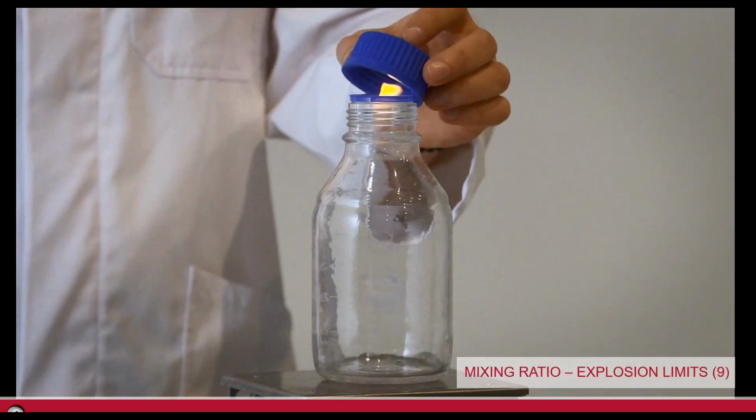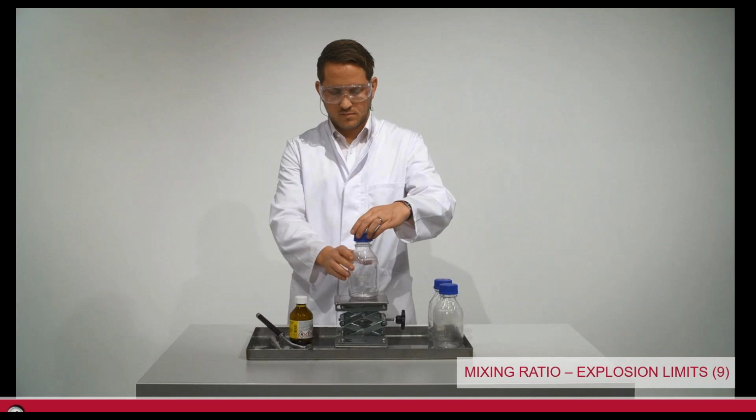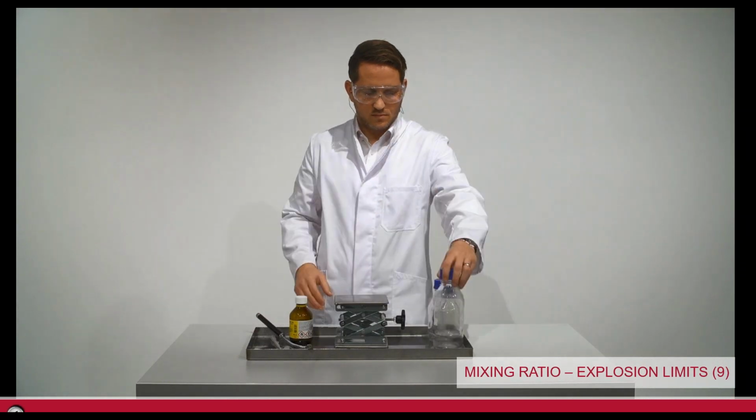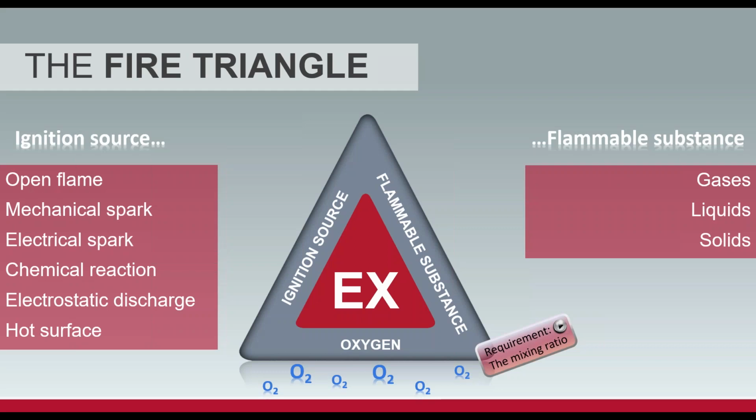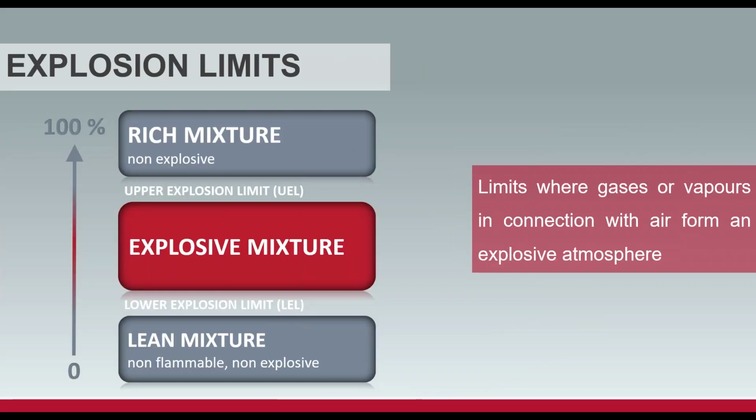What happens, right? So 1 drop, nothing. 5 drops and 500 mils, it goes crazy. And whatever he put in there, who knows, right? It was a good example of not the liquid burning, but the flames on top of it burning. So it's simple. I make light and kind of have fun with that. It's a lot more fun, the explosion and stuff, when there's sound, and I can do that in front of you.